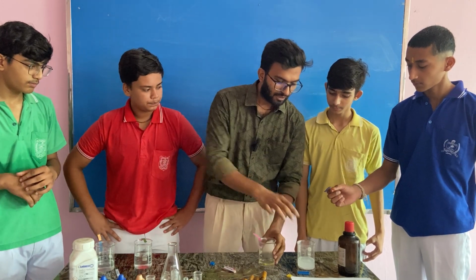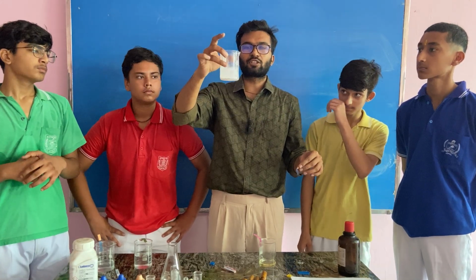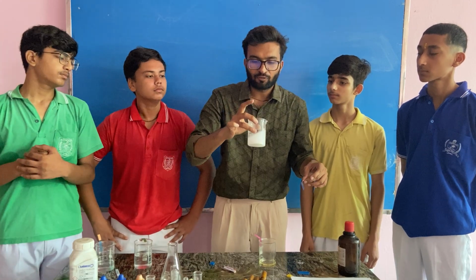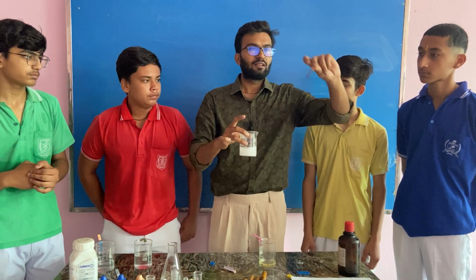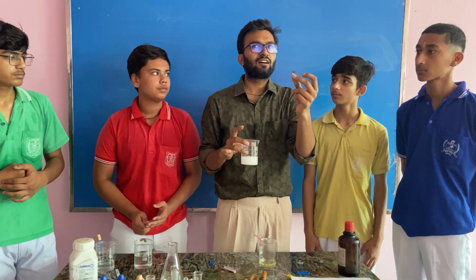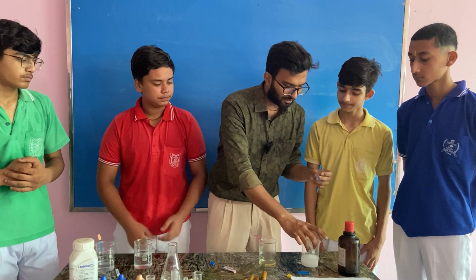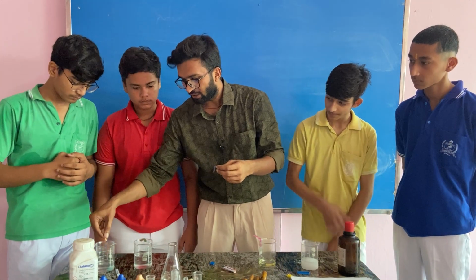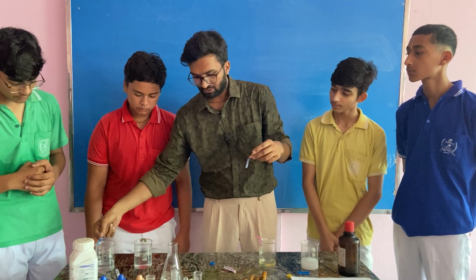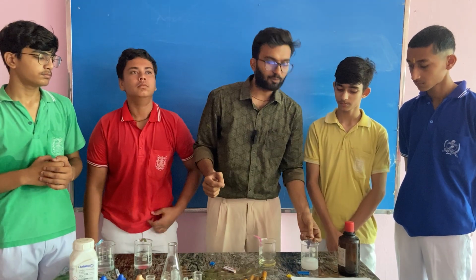Let's see. It's the solution of detergent. If you shake it, then there will be the formation of foam. झाग बनेंगे इसके. And the color is, now tell me the nature. Weak base. Sir, how can you find out that it is strong or it is weak? Let's compare these two. If I dip it, it will change into dark blue and it is light blue. So you get my point?